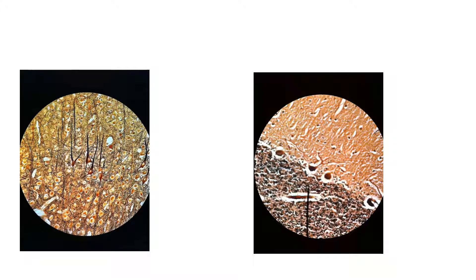In this microscope slide, what you're seeing are actually a couple of things. These cells right here that look like little triangles are called pyramidal cells, or pyramidal cells, because they look like little pyramids.